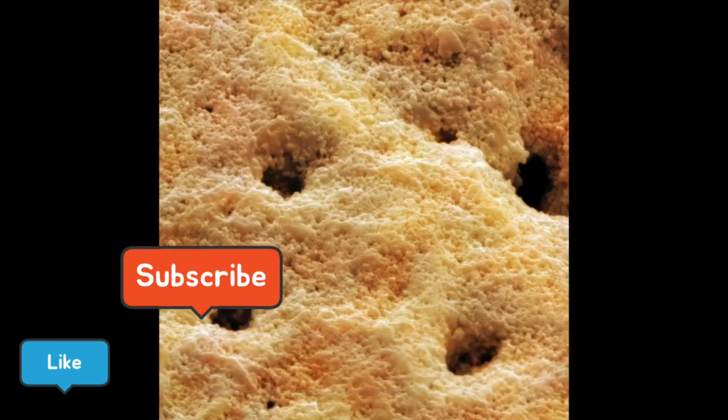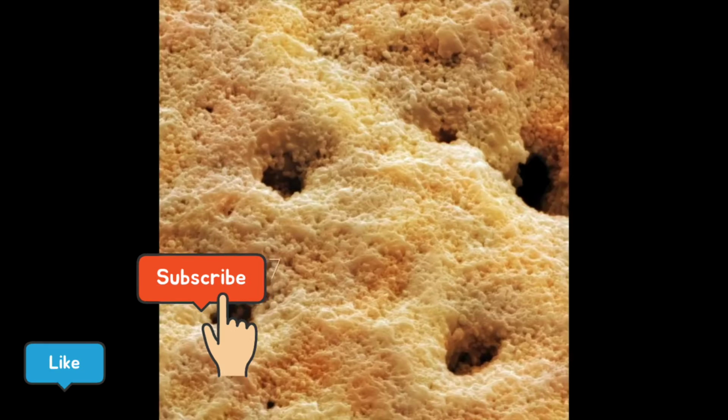This is the outer shell of a chicken's egg, and the holes, or micropores, seen in this image enable gaseous exchange of the developing embryo. Most of the eggshell material is calcium carbonate, which accounts for 1/10 of the egg's weight.